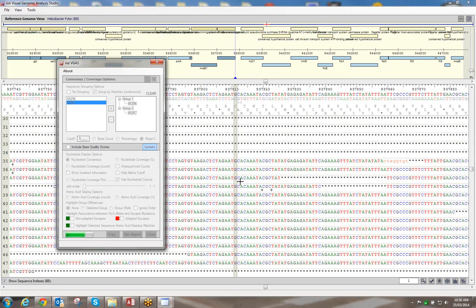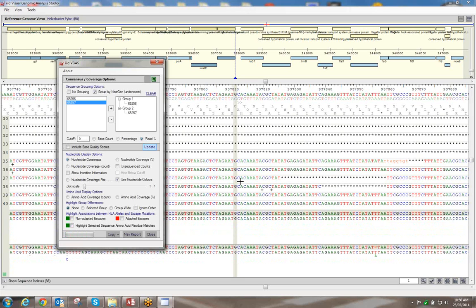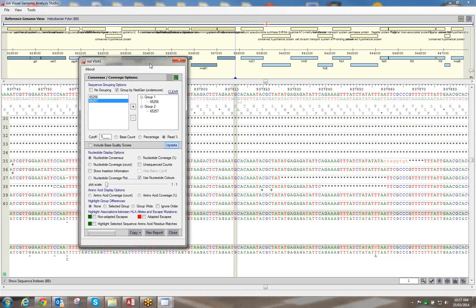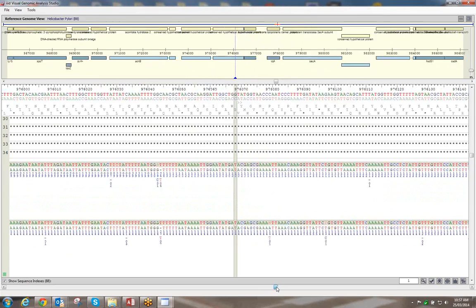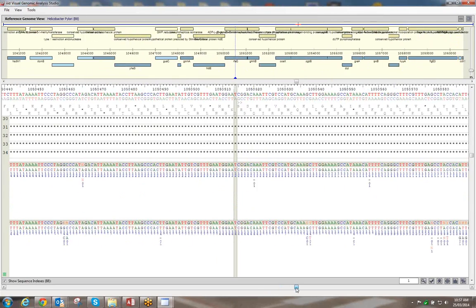Do you have a way to normalize the read count — convert it to FPKM? That's fragments per kilobase per million reads, commonly used in human data. We'll look into that. Now you can look at the coverage and consensus for both groups stacked underneath each other. If you want to look at the group differences, you can do it between the selected sequences or group-wide.